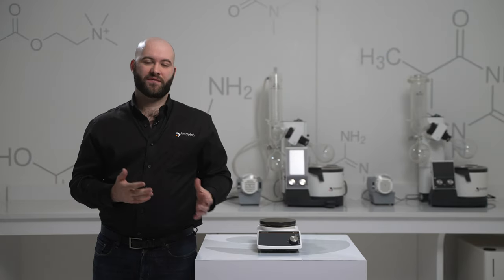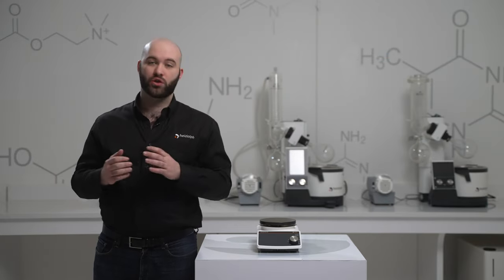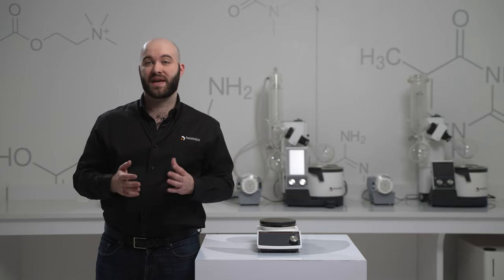The first hotplate that received an update was the hotplate mix 20L. This replaces the high mix L.